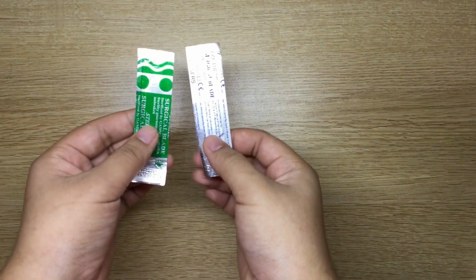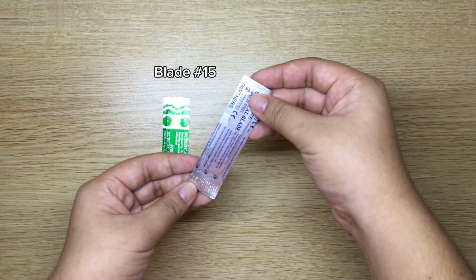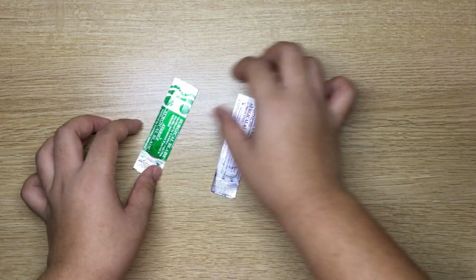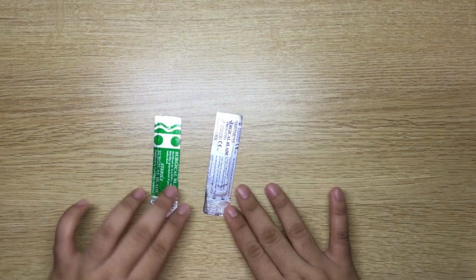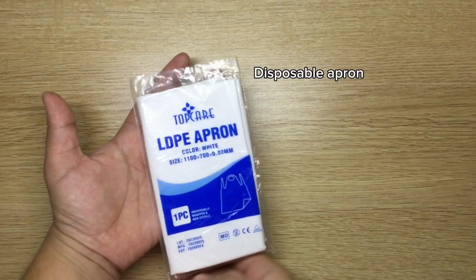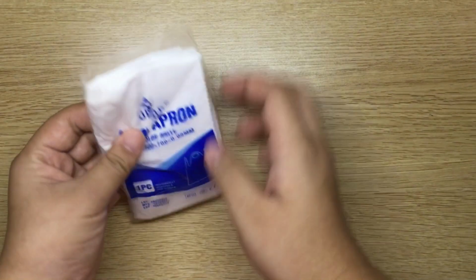Then, we have here an example of disposable blades. We have number 15 and number 20. These blades have a specific use. Number 20 is used for larger incisions, while number 15 is used for opening coronary arteries. Lastly, a disposable apron is essential and plays a huge role in infection control and cross-contamination prevention.